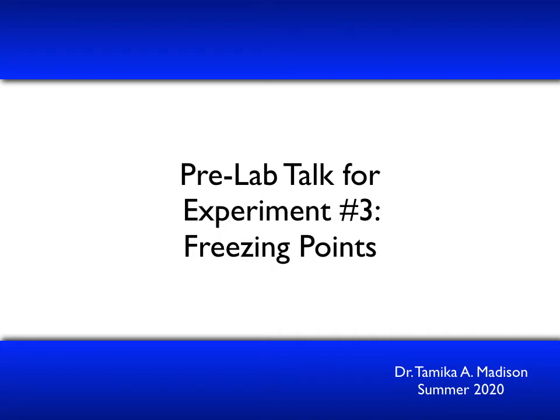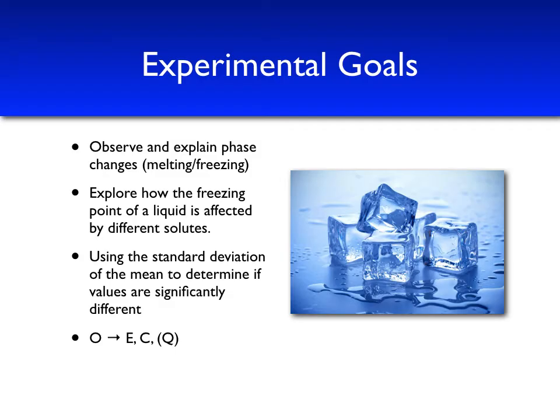This is the pre-lab talk for experiment number 3 for Chem 120 lab, freezing points. The goals of this experiment are to observe and explore phase changes, namely the melting and freezing point equilibrium. We'll also explore how the freezing point of a liquid is affected by different solutes.